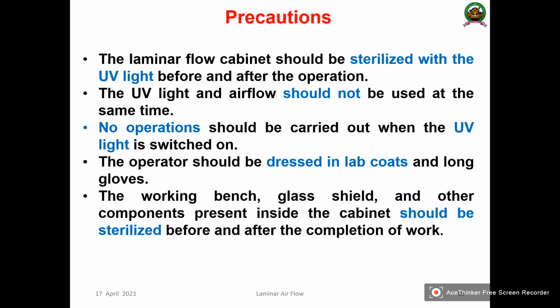No operation should be carried out when the UV light is switched on, because UV light is highly carcinogenic and mutagenic. The operator should be dressed in a lab coat and long gloves.